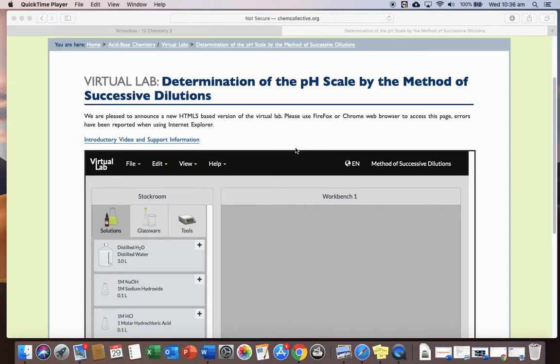Welcome to the virtual lab. You are going to be using this program to demonstrate how to do a successive dilution.